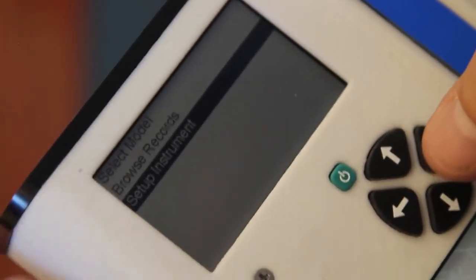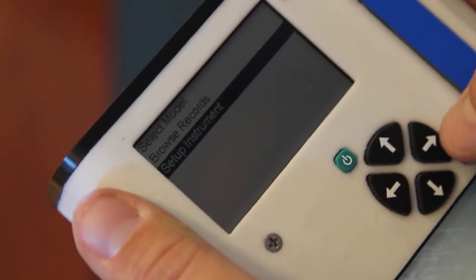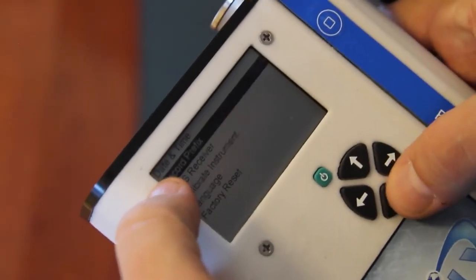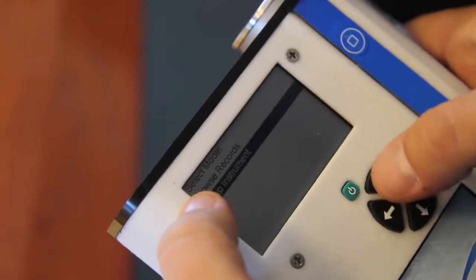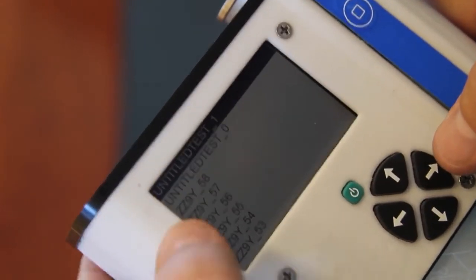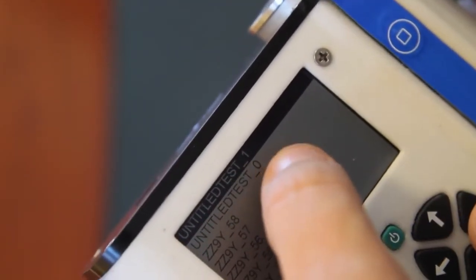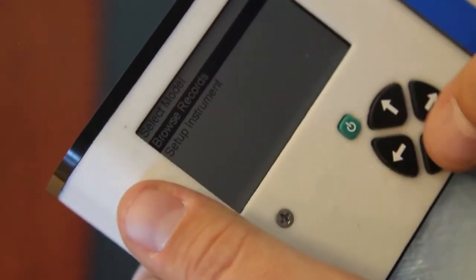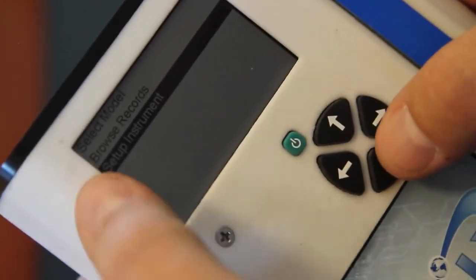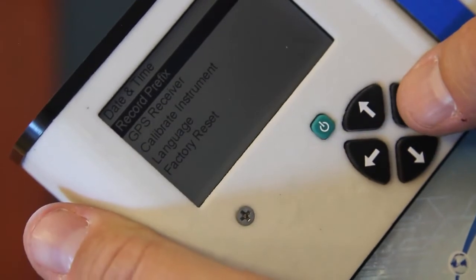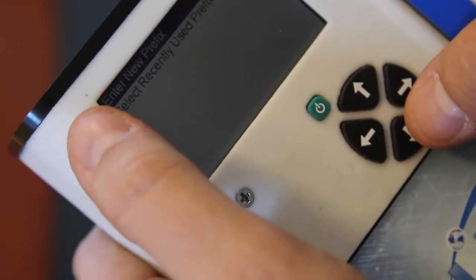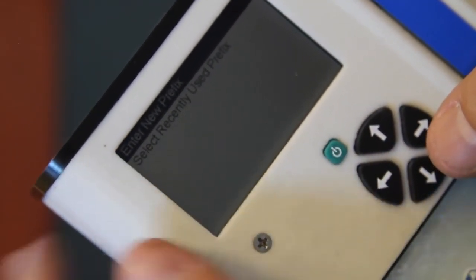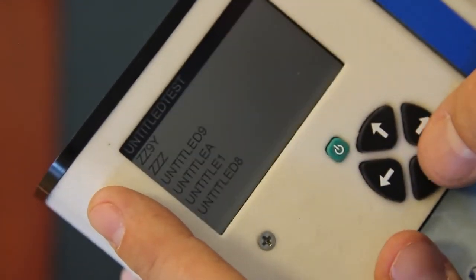Another common feature that users might see themselves using on a daily basis is setting the record prefix. As you can see in the records menu, each file is assigned a particular file prefix, and then a number that increments follows the prefix. To do that, we would go to setup instrument, record prefix, and we can here either enter a completely new prefix or select a recently used prefix.